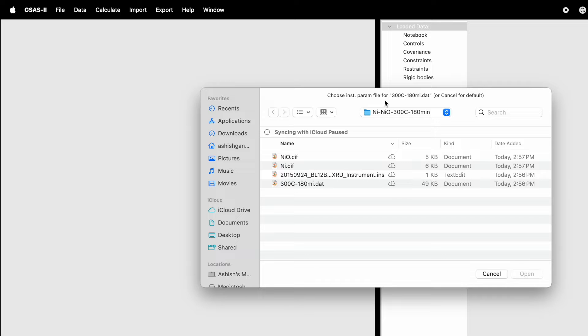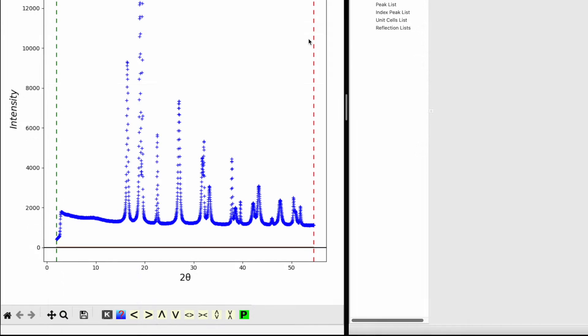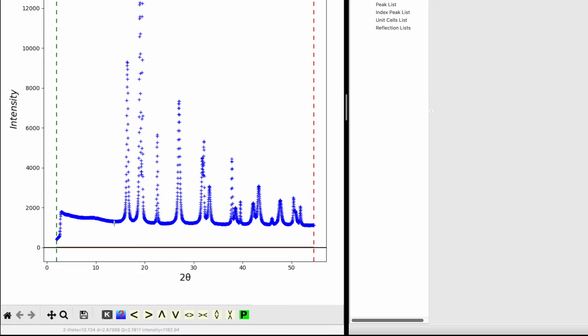When prompted, double-click on the instrument parameter file. On the left-hand side, you can now see the XRD data.